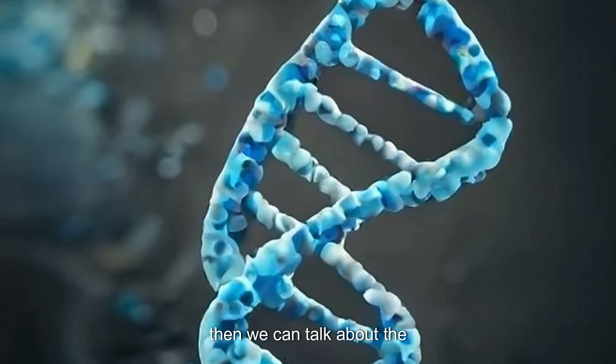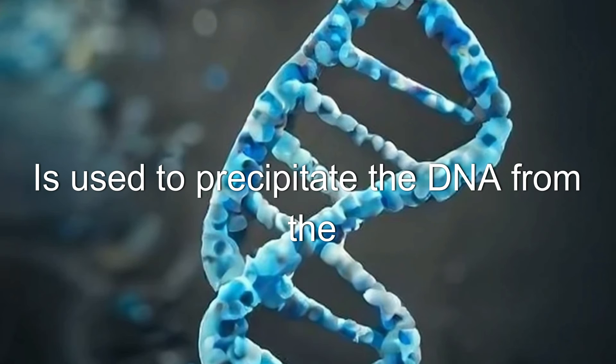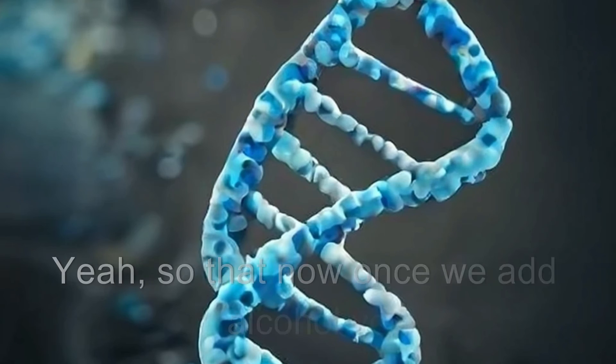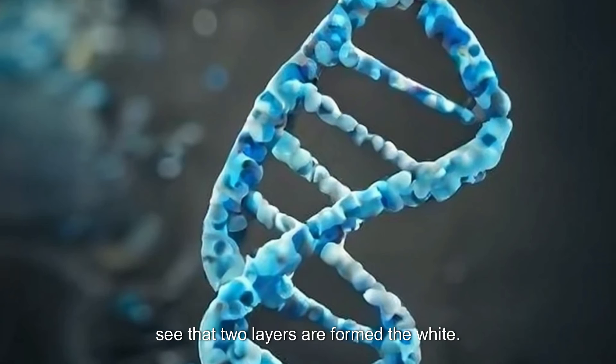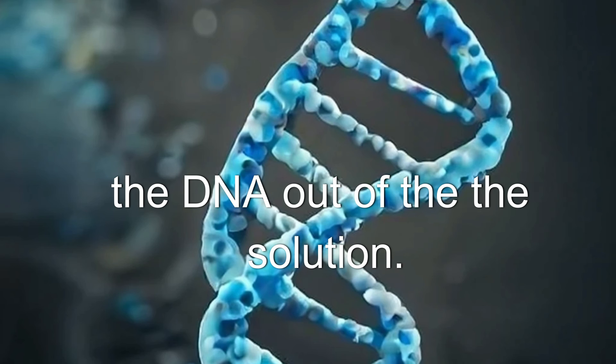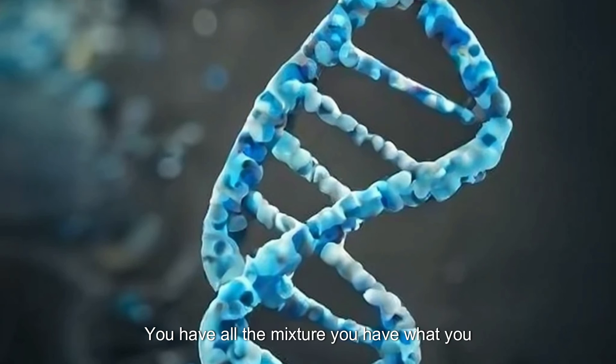Then we can talk about the alcohol. Alcohol is used to precipitate the DNA from the solution. So that now, once we add alcohol, you will see that two layers are formed. The white mist or white cotton-like mass will be formed on top of the beaker. If you are using a beaker, if you are using a glass, whatever you are using, you will be able to see those two layers. But after adding alcohol, alcohol is very important in precipitating the DNA out of the solution or the mixture you have prepared.